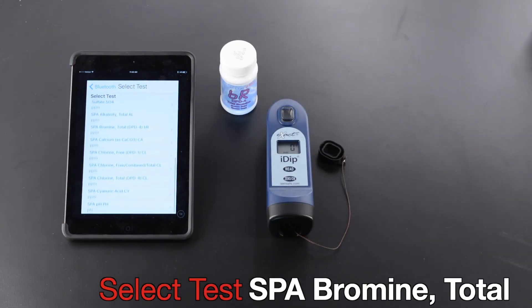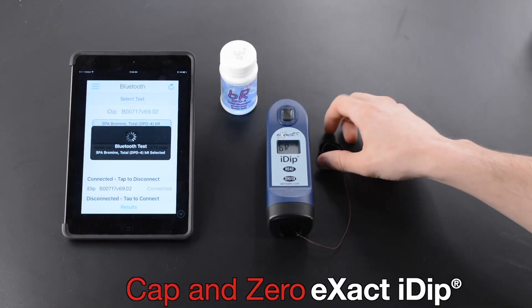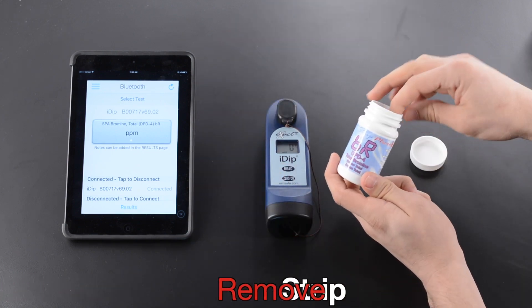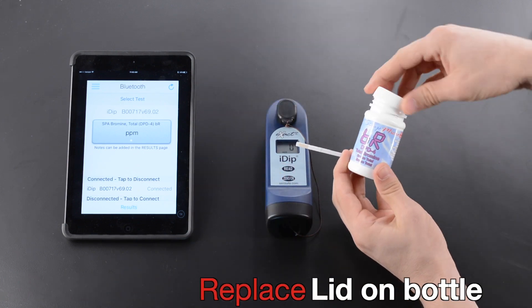Select Test. Cap and zero XactiDip. Remove strip. Replace lid on bottle.